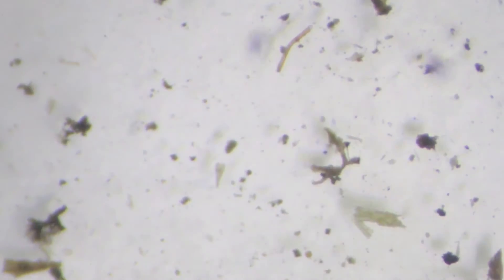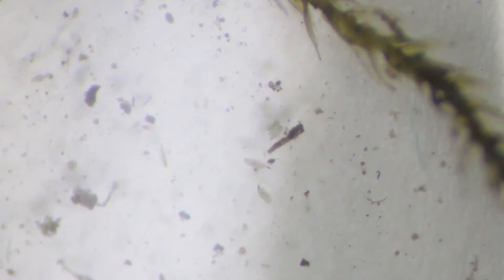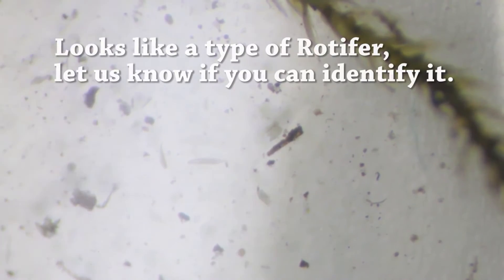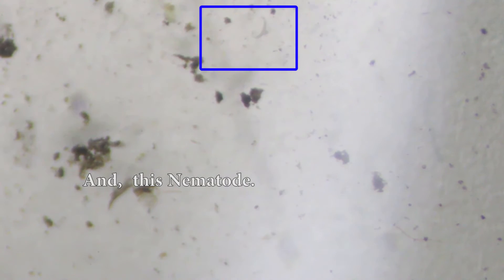Do you see any critters we should catch? Look, look — there's a critter! Look at that thing. What is it? It's a little worm thing, like an inchworm. It's moving right down there, it's about to leave the frame. Now it's gone. We'll look at it on the video later.